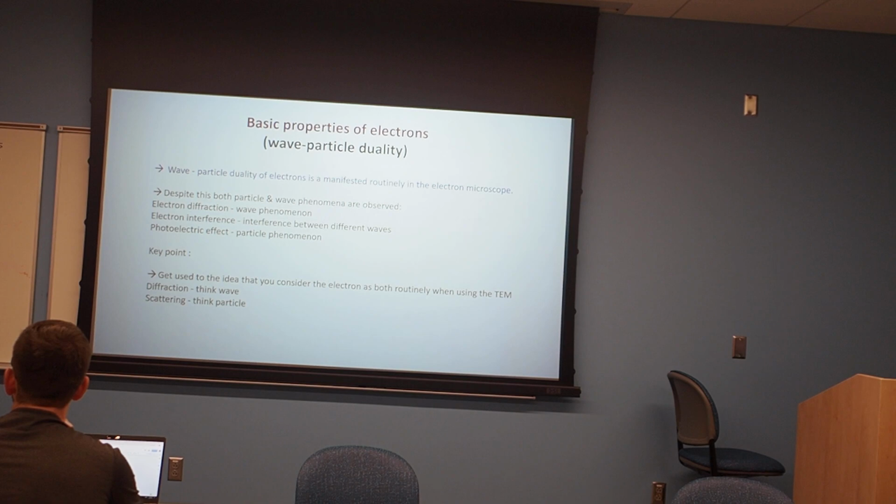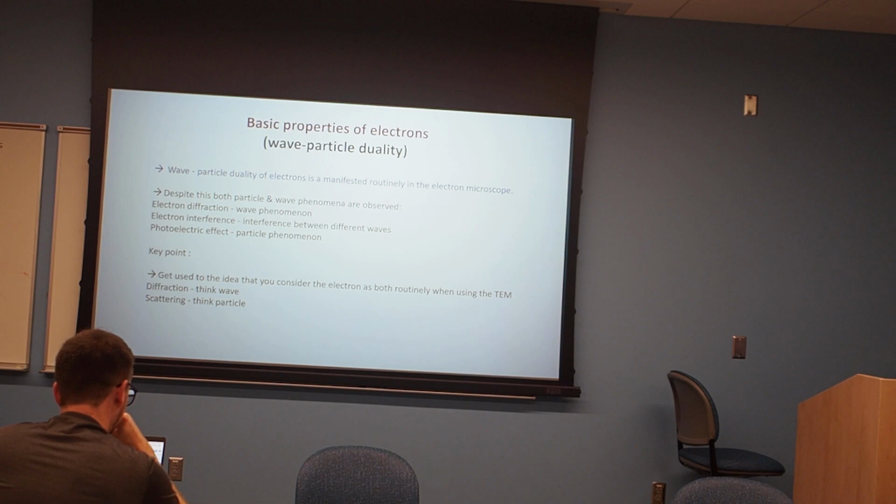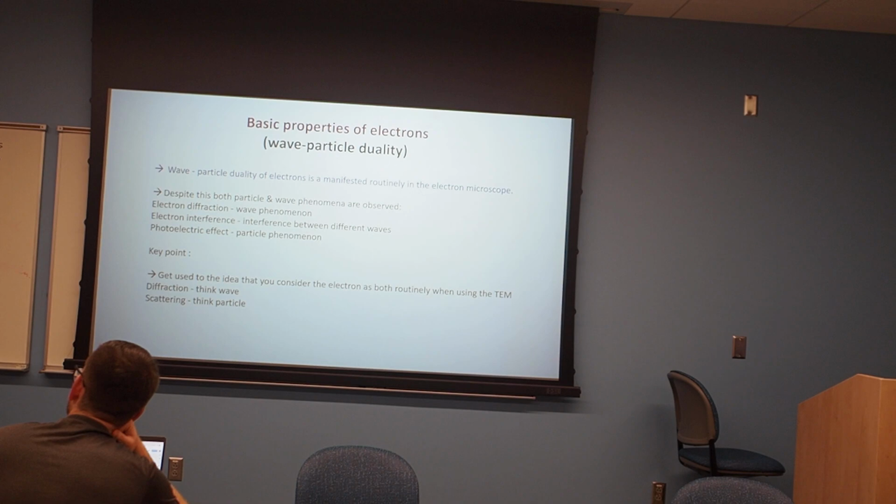So once you have an electron shooting in, your crystal is like this, having a spacing of d, and it generates a pattern with dots. By studying this pattern, what is it? There would be a bright spot in the center, and there would be diffracted spots. If it's a zone axis where multiple planes meet, it would give you a signature of the exact zone where your crystal is, right? The central spot is the brightest spot. Why? Because it consists of the main light that is coming here, whereas these spots come from the diffraction from these planes.